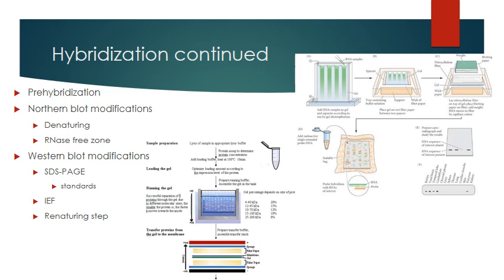If you're going to use this, it requires a pre-hybridization step. In this step, you prepare the fragments that you separated for the binding of your probe. If you skip this step, you're going to get a whole lot of non-specific binding to random sequences, which will cause a high background in your results.